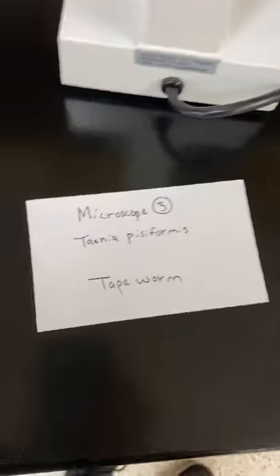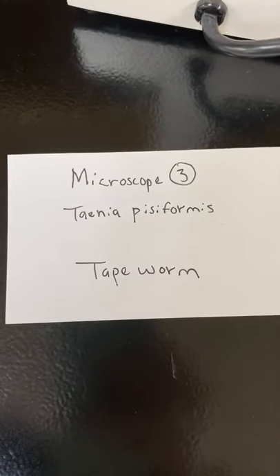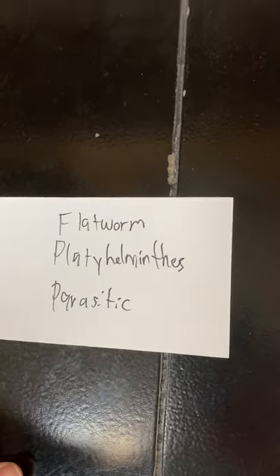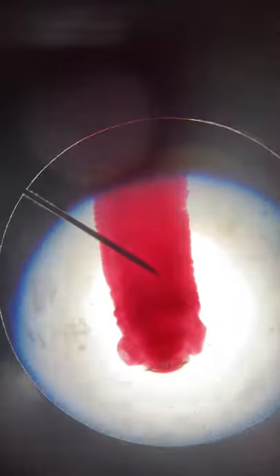Microscope three: this is a tapeworm, which is a flatworm, phylum Platyhelminthes, and it's parasitic. This is its head right here — you can see the hooks and the suckers.